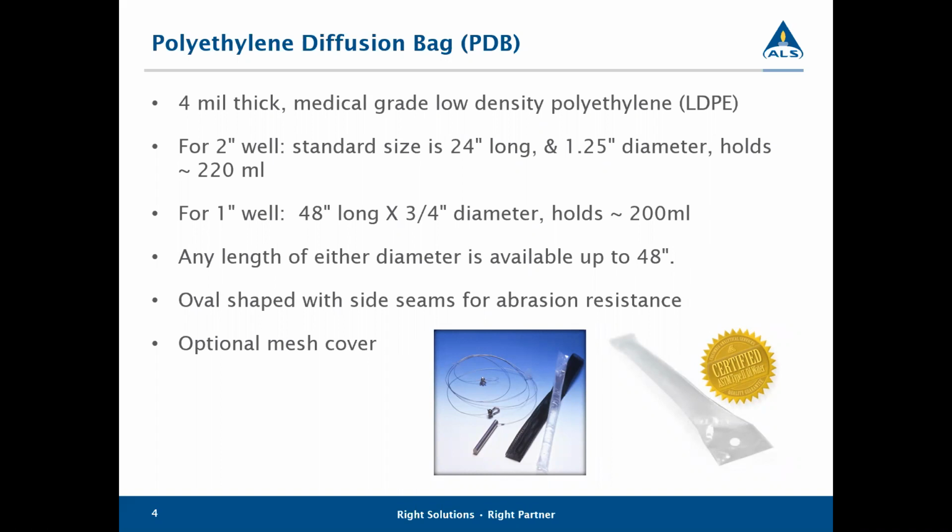Obviously, data is always the most important thing. We need to have usable data. And as long as the passive diffusion bags are used properly and for the right application, data quality will not be an issue. These are made fairly ruggedly. They're designed to withstand field conditions.